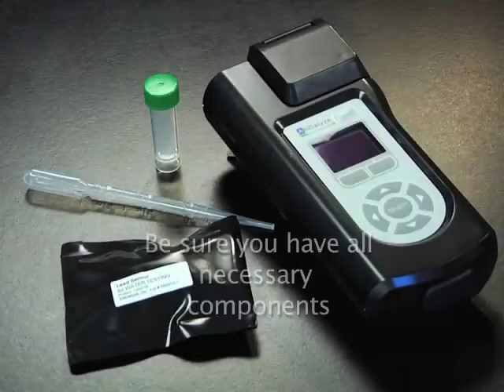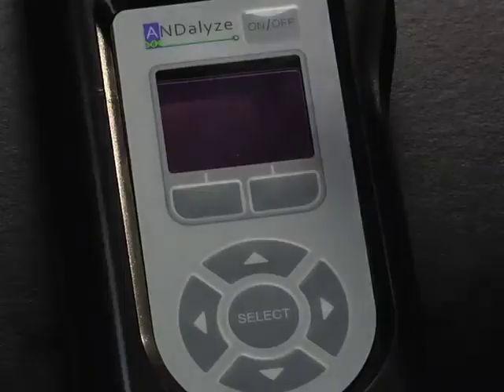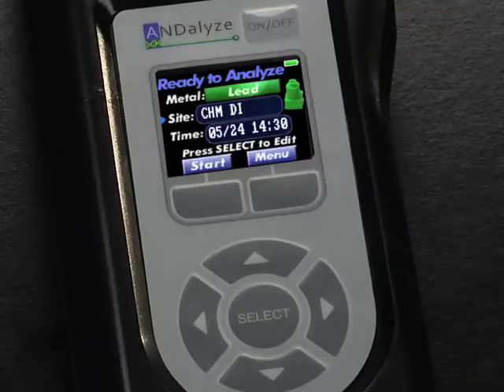Be sure you have all the necessary components you need before starting the test. After charging the fluorometer, push the power button. The screen should read: Ready to Analyze.